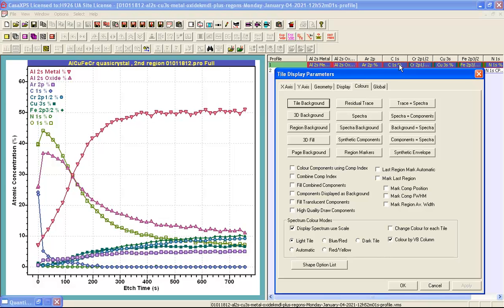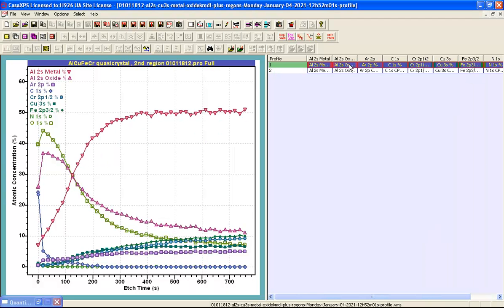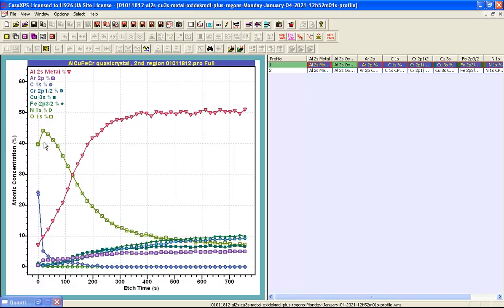So if I deselect one of these VAMAS blocks and then overlay the data we see that the aluminium oxide trace has been removed.